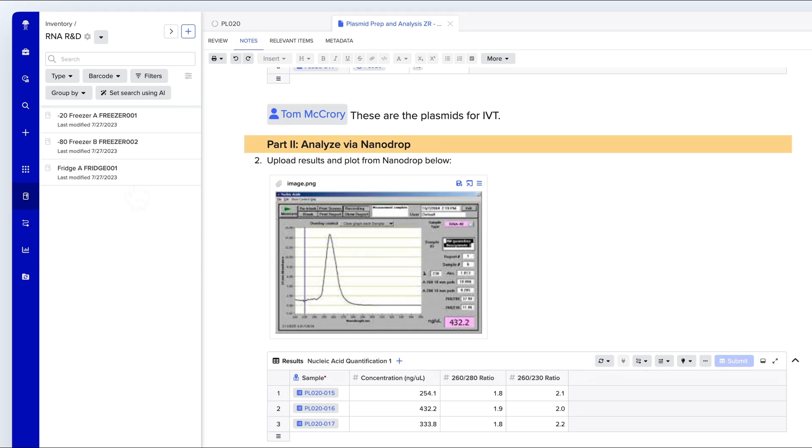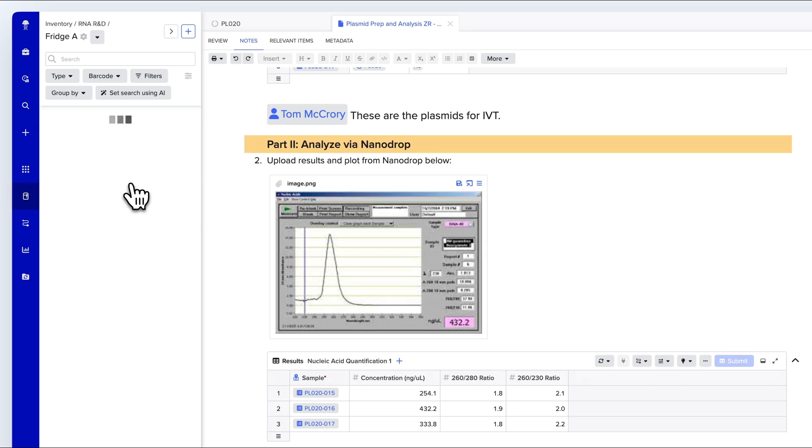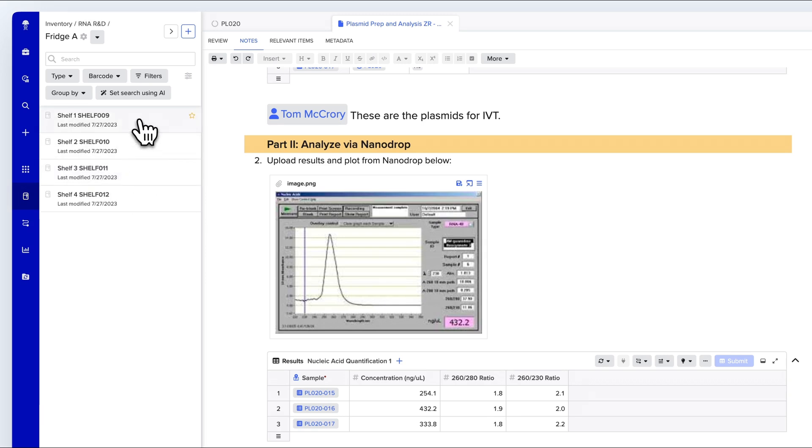The inventory is designed to reflect physical locations. In this case, we can see locations such as buildings, rooms, and shelves. On this shelf, there are various tubes. Let's open up one of these tubes.